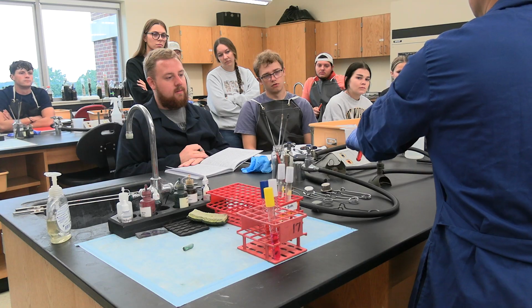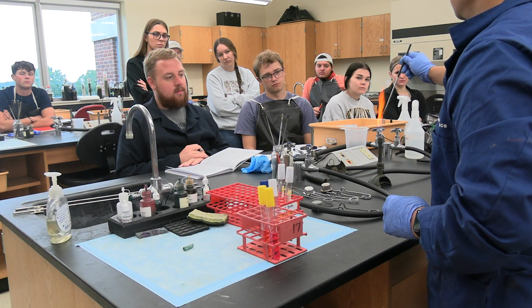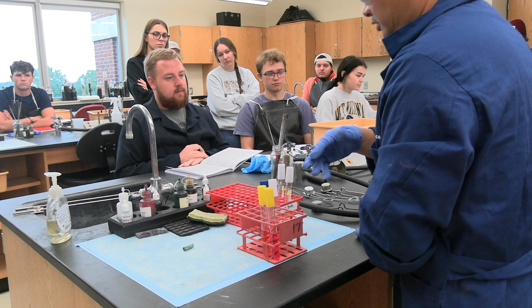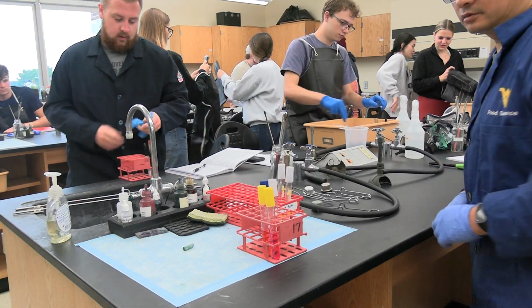That's all. Don't block the Durham tube. That's important for testing the gas, otherwise you're not going to see it. That's all. So finish all of these. Very good. Be careful.